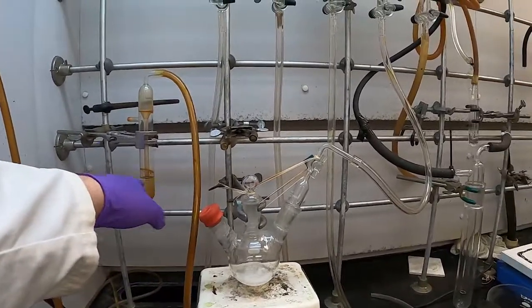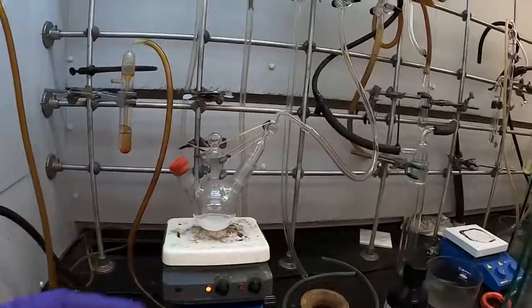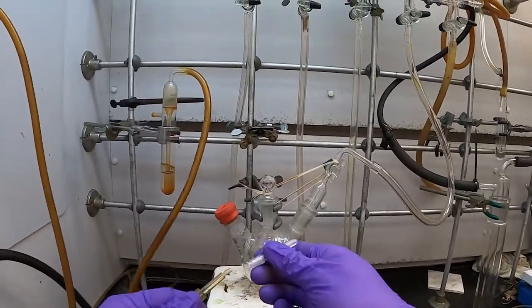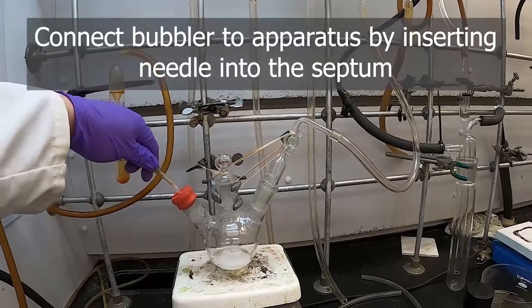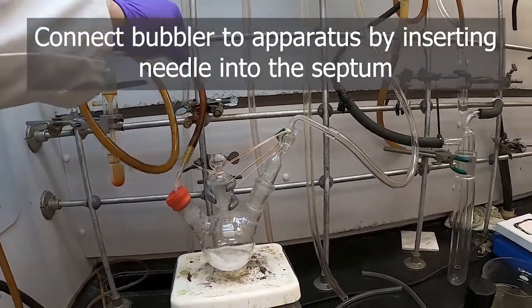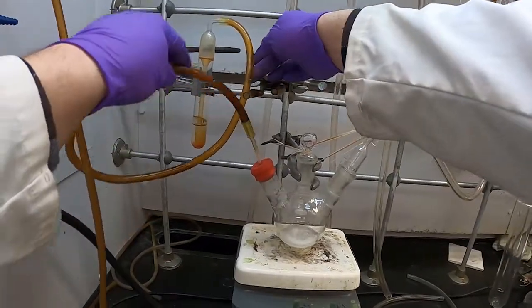So an oil bubbler allows gas out but not into our system. So to connect that, we'll take a hypodermic needle, attach that to the end of the syringe that's been mounted in this tubing, and insert that into our system here. Sometimes it's a good idea to clamp this tube up out of the way so that it doesn't strain the needle or the syringe.